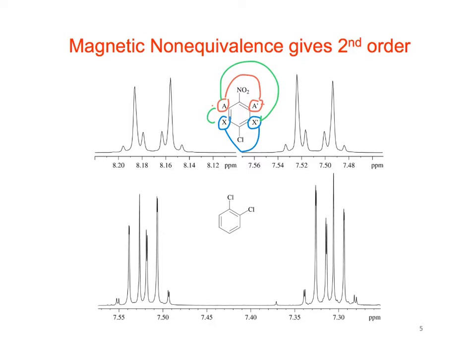And that's what we mostly see, if we look at these two peaks here. But we've got all this stuff down here at the bottom. You might think it's impure. But this is all resulting from these second order effects.